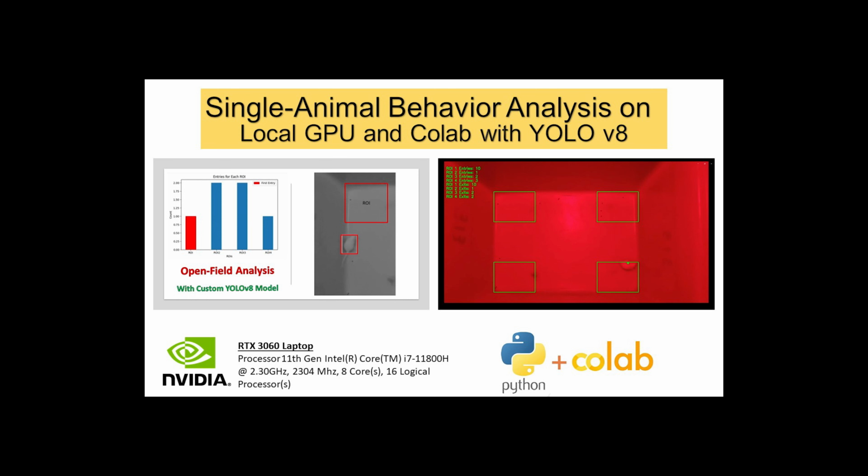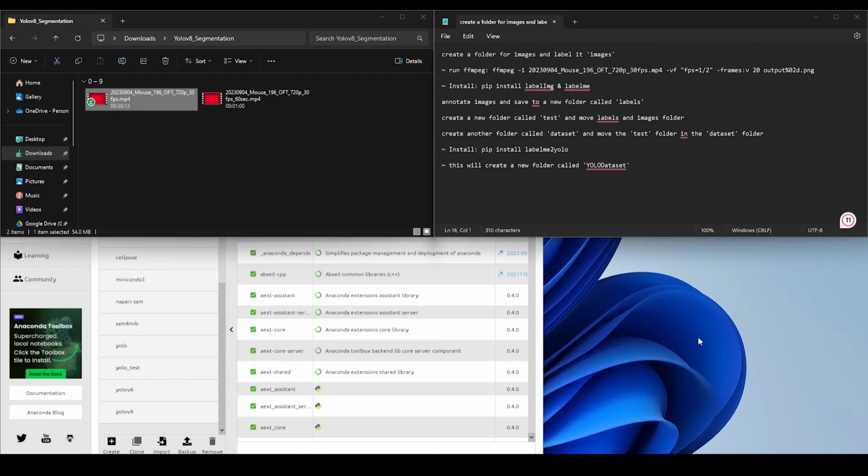In this video, I'm going to go over how to utilize YOLOv8 for single animal behavior analysis. So let's go ahead and open our Anaconda and make sure our training videos are in a folder.